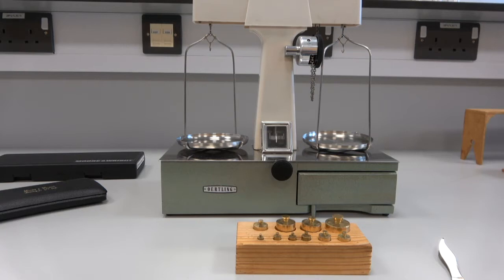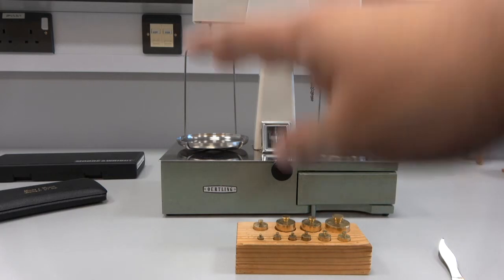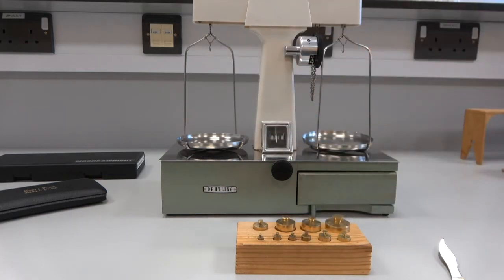Most electronic scales can be disrupted by magnetic effects. Whereas this one, because we're just literally using a kind of balanced pan like the scales of judgment, it can't be affected that way.